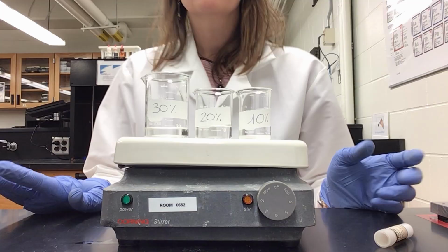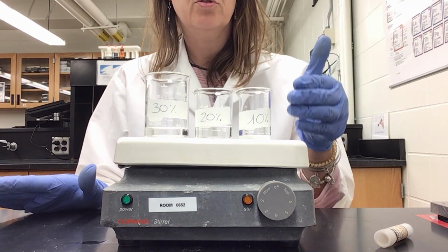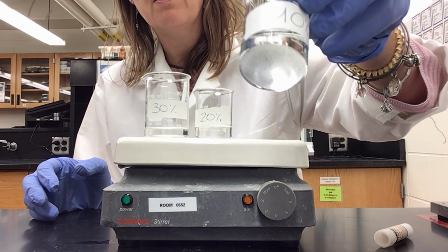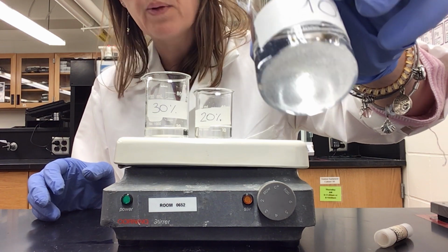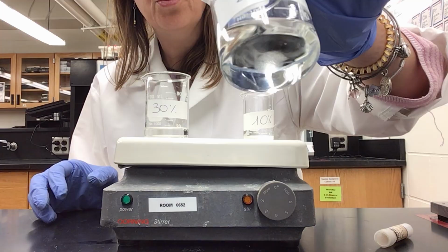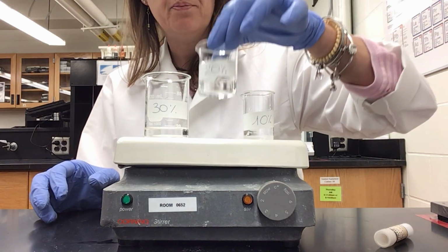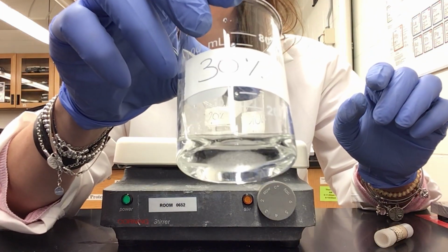Now that I added my solvent, water, to the sugar and I made my solutions, I noticed that some sugar is on the bottom. It didn't completely dissolve. This is the 10%. This is the 20%, which I shook a little bit, so now it's better. And this is the 30%, which I shook.